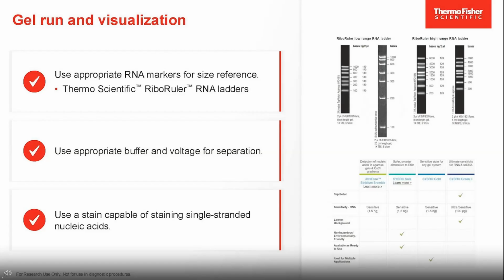And finally, when you are working with electrophoresis, it's important to set the voltage and the buffer. It's important to set the voltage correctly to make sure that you have your full separation throughout the full range and a reasonable amount of time to obtain the optimum resolution.